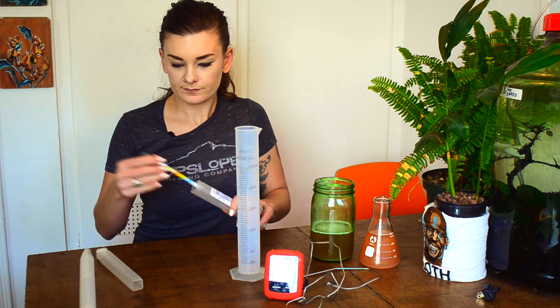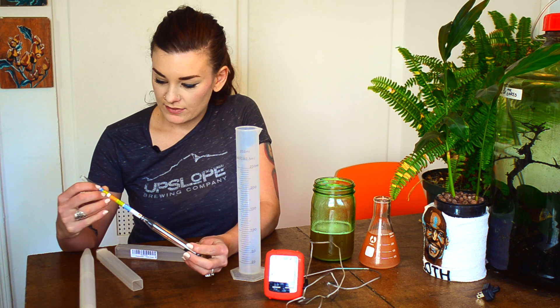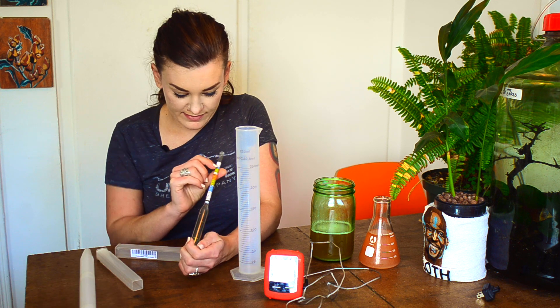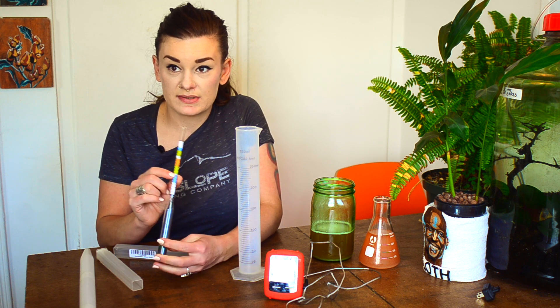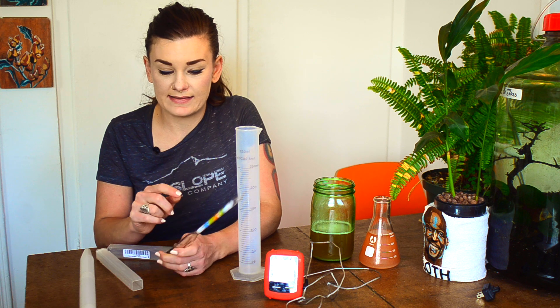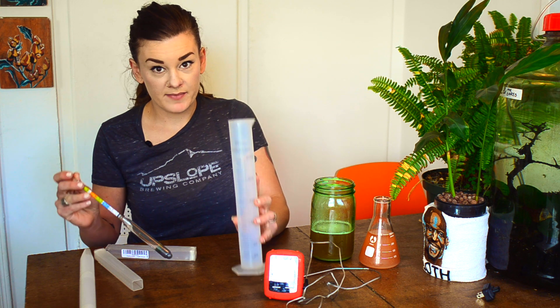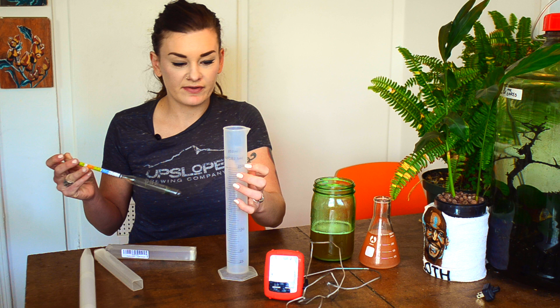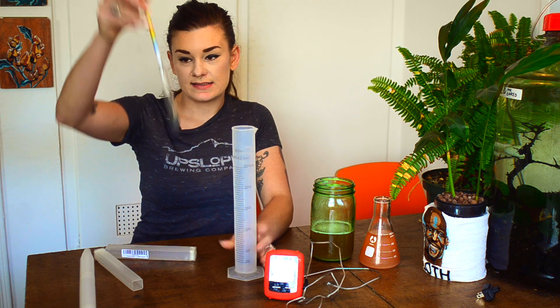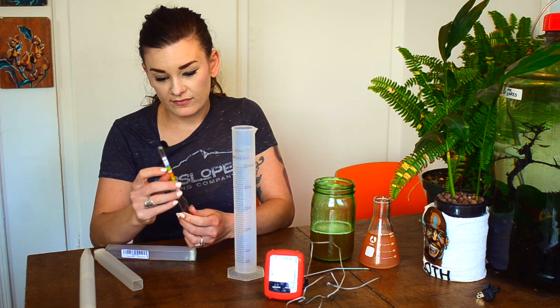Here's a hydrometer. It has numbers going down the stem and those are related to specific gravities. What you're going to do is put your unfermented or fermented wort into a tube like this — I usually fill it to 250. Then you drop your hydrometer in, spin it, and it'll land at one of these readings.